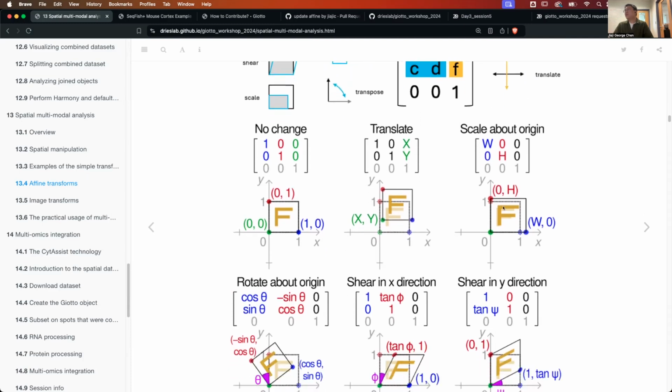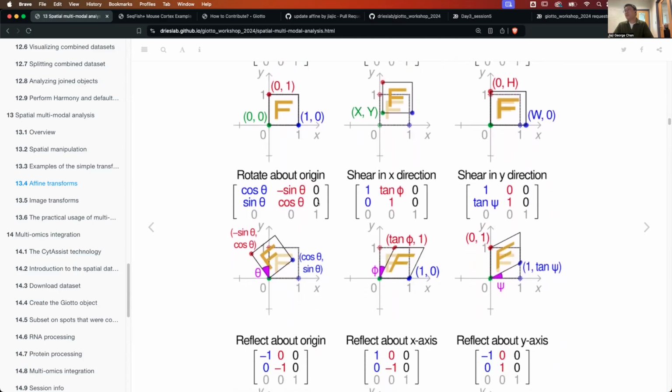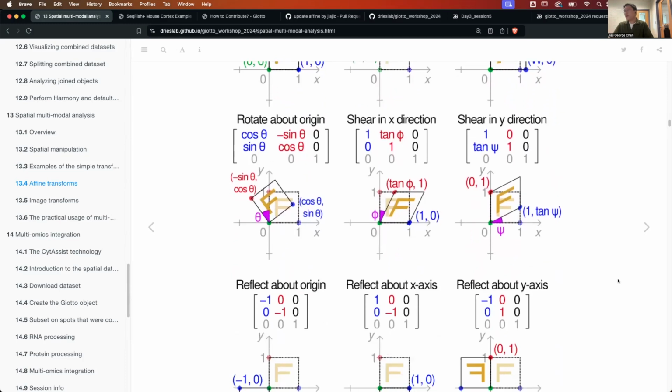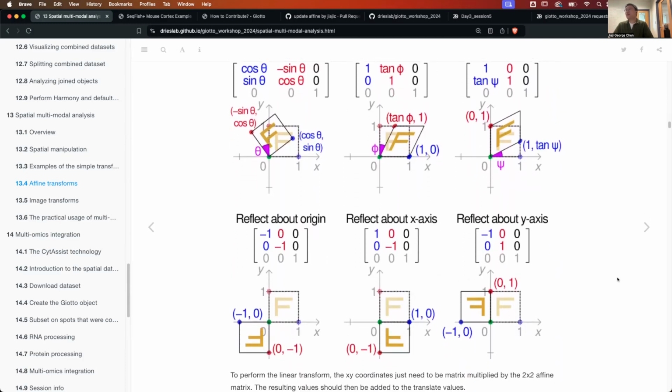And then you can also scale. So that's when you change these values instead of scaling it 1 to 1. And now you can scale these individual values. So these are all very nice and clean. Yeah, rotation is interesting. It's when you start adding them together that the matrix starts looking very interesting, and it's harder to figure out exactly what's going on when it's applied across a single step.